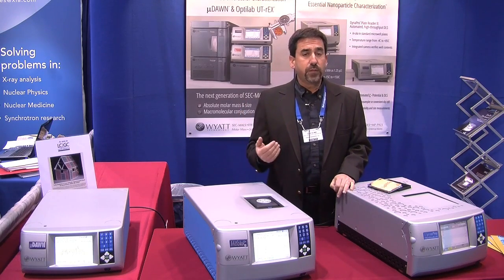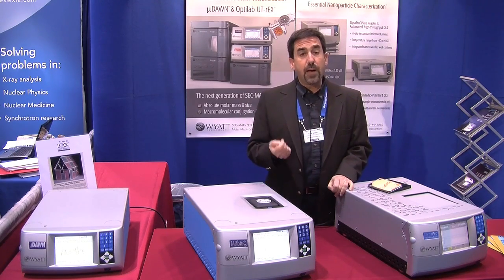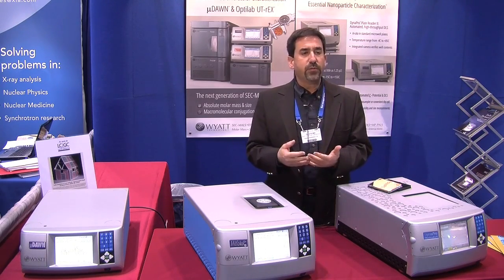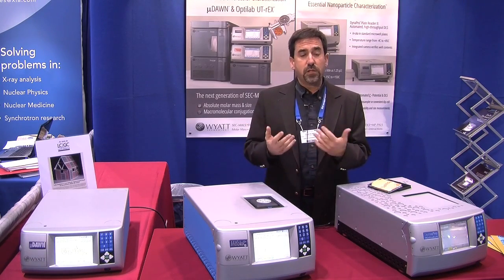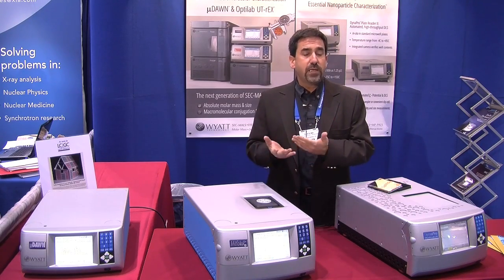Some of the other capabilities include characterizing macromolecular interactions, for instance, protein-protein binding. We do that via a technique called composition gradient light scattering. We have another device which is similar to a stop-flow device and mixes different compositions of proteins with each other or with dilution, and injects them into the light scattering detectors. The light scattering measures the absolute molar mass of the solution. And when complexes form, the solution molar mass increases, and by teasing out that relationship with composition and concentration, you can actually determine binding affinity as well as absolute molecular stoichiometry rather than just stoichiometric ratio. And all this is done in solution without any labeling or without any immobilization.